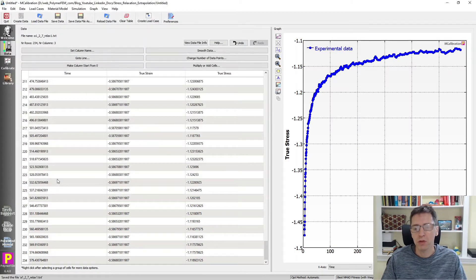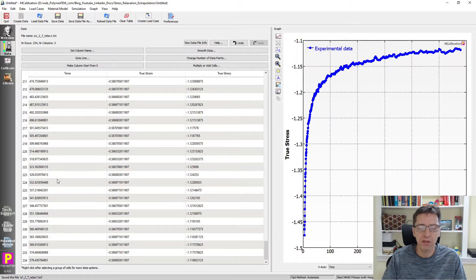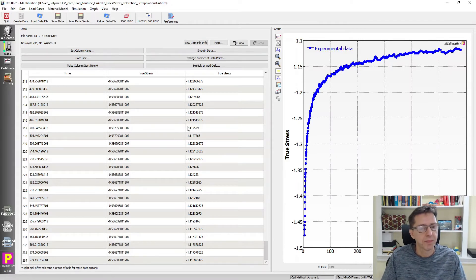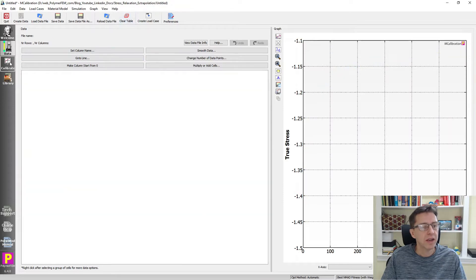I'm going to call it the file name and relax1. This rubber happens to be a chloroprene rubber that's lightly filled with carbon black.